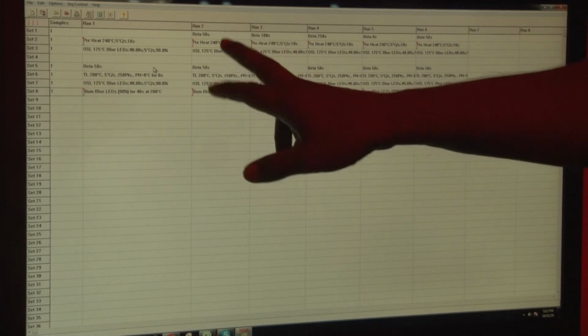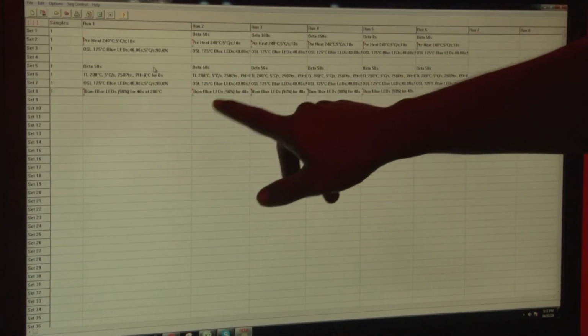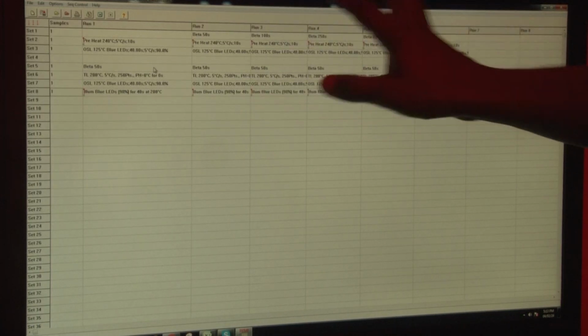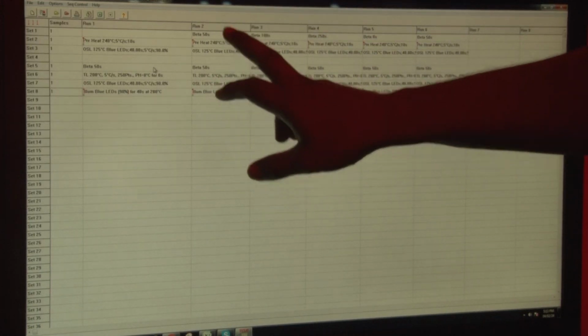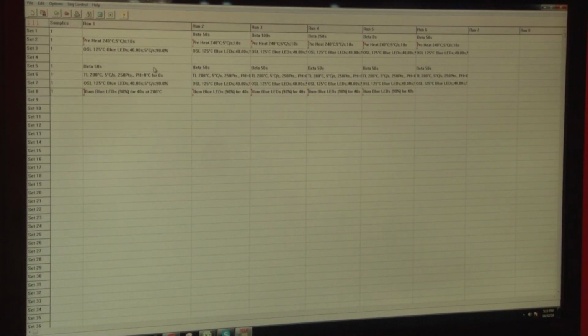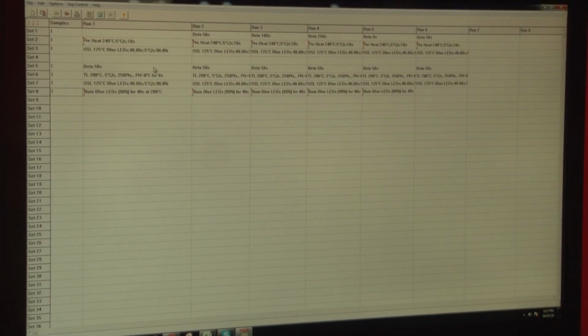Recycling means on the two runs we are giving the same dose, so the photon count should be the same on both runs. That is basically to check the recycling, meaning the repeatability of the sample.